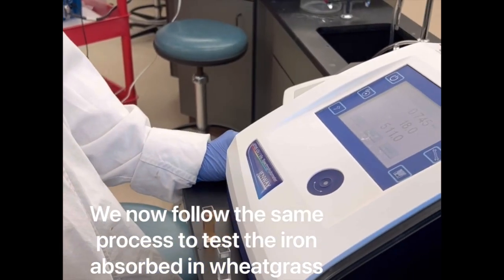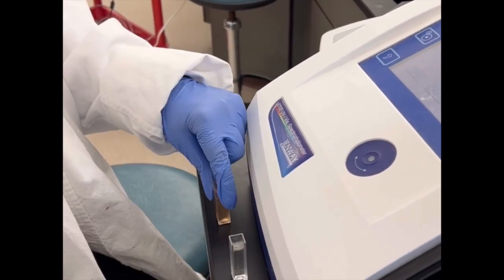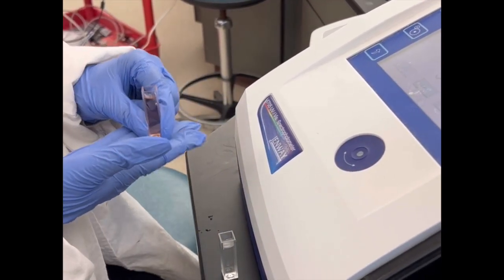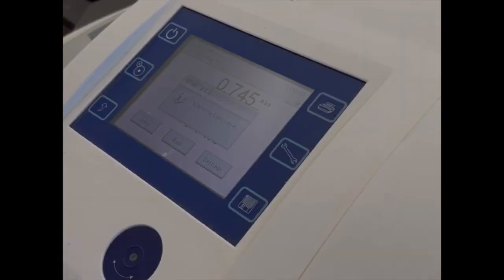So after dissolving our ash in acid and adding our solutions, we're given a sample solution for the iron found in wheatgrass. Run it as a baseline. We replaced our blank solution with our sample.